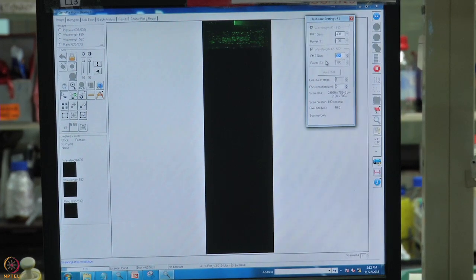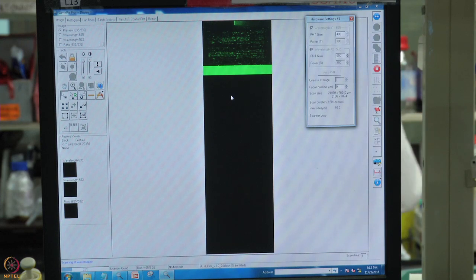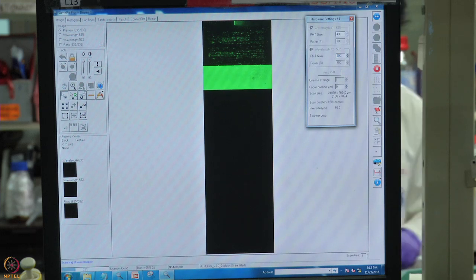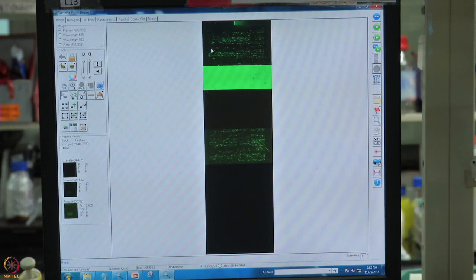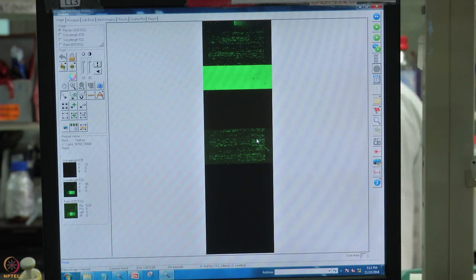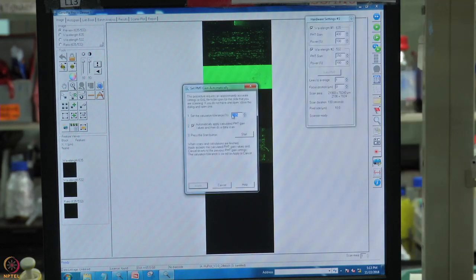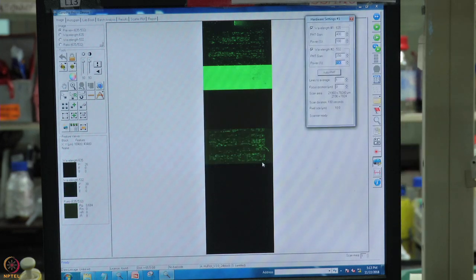Here is a demonstration of how PMT gain can change the contrast of the slide. Scanning at 350 PMT gain gives one level of intensity. Increasing to 650 increases the scanning intensity significantly, while reducing to 200 reduces spot intensity. For the PMT gain settings, we must ensure not all spots are getting saturated, while also not losing intense spots. There is an Auto PMT option — once you press apply, it scans at 3 different PMT settings and recommends the best setting.